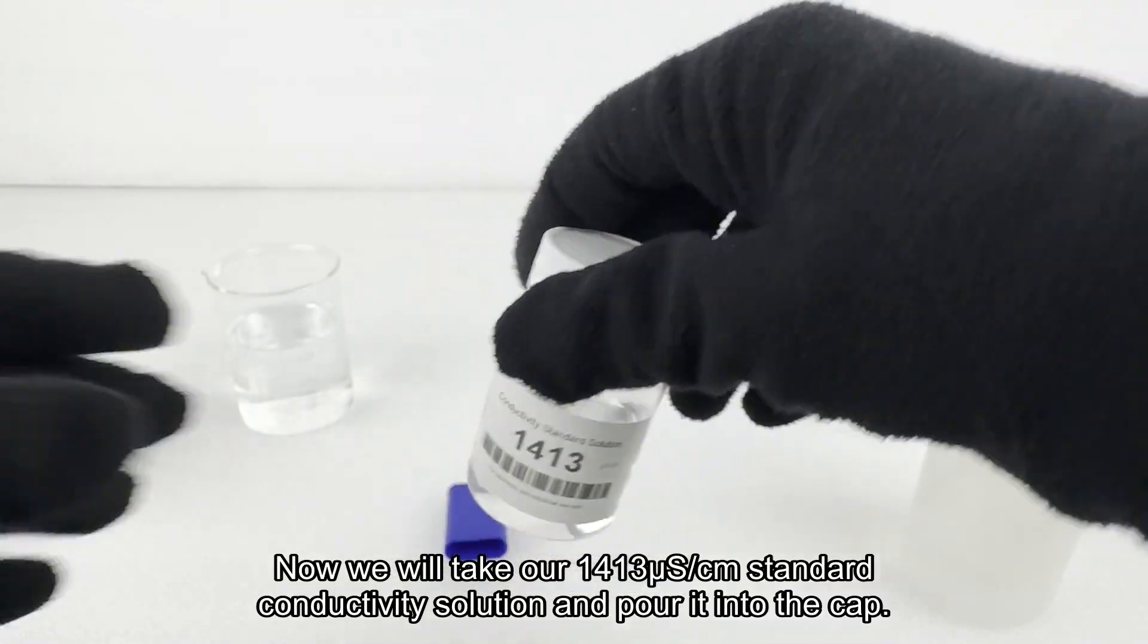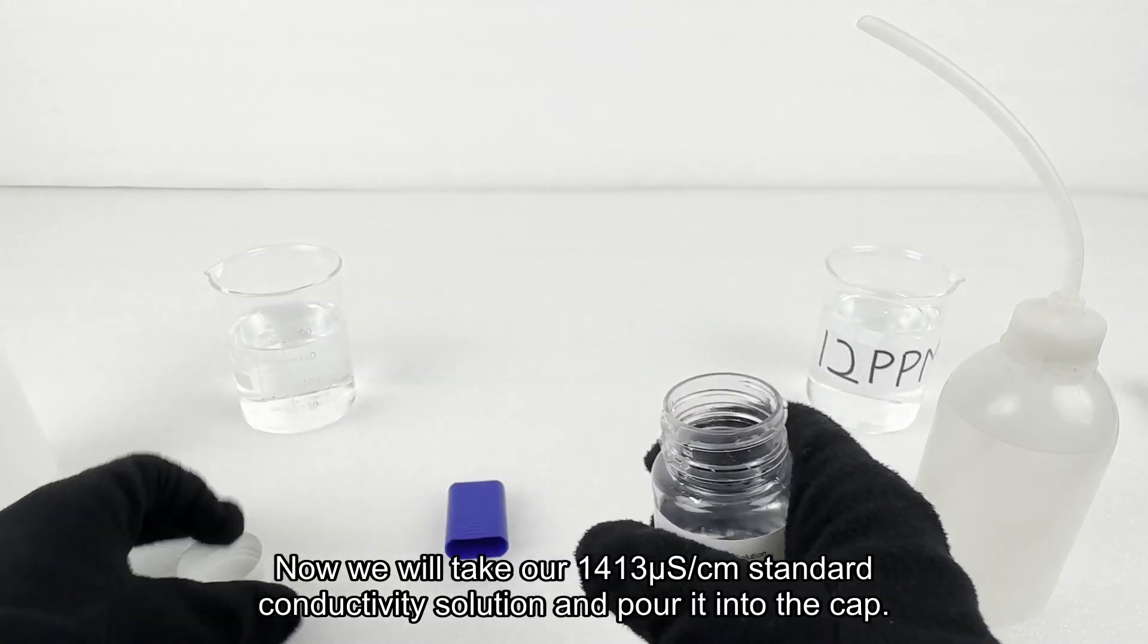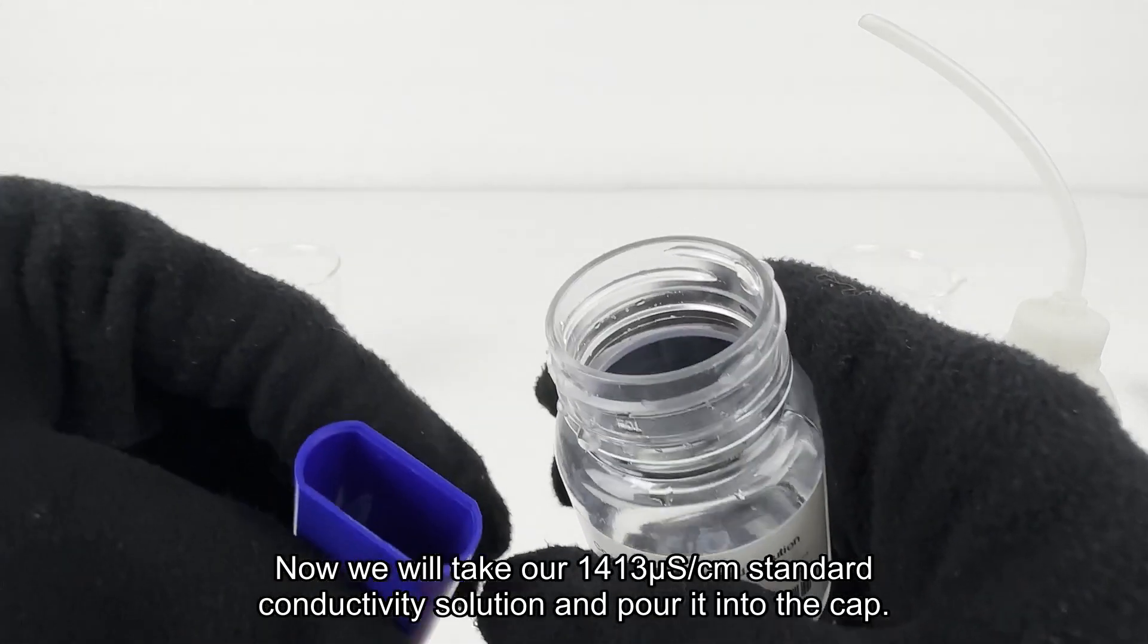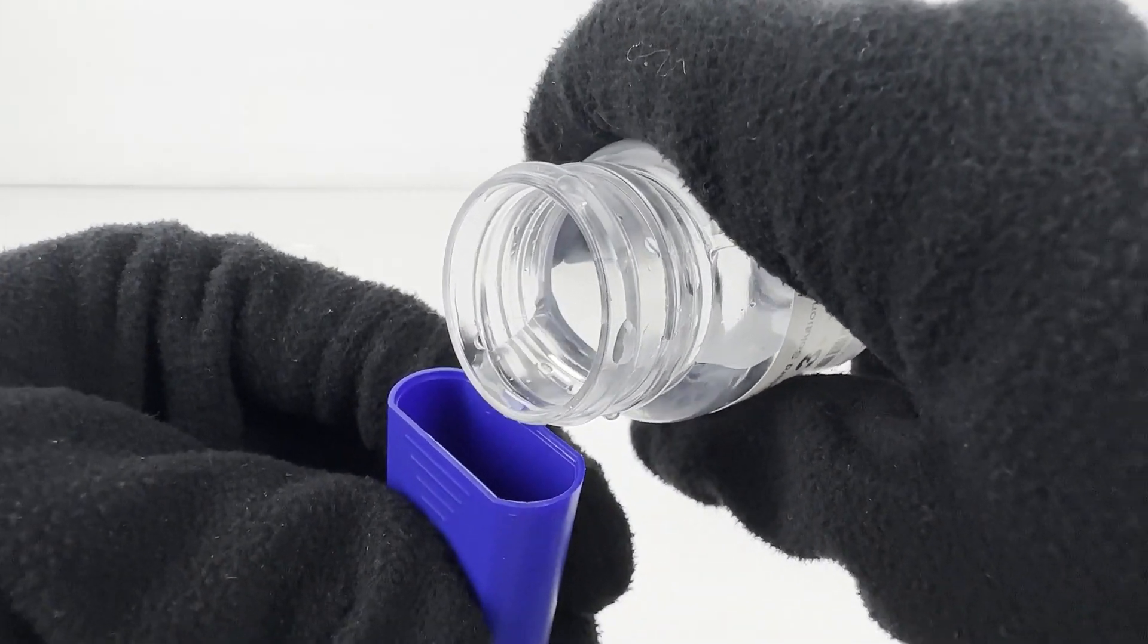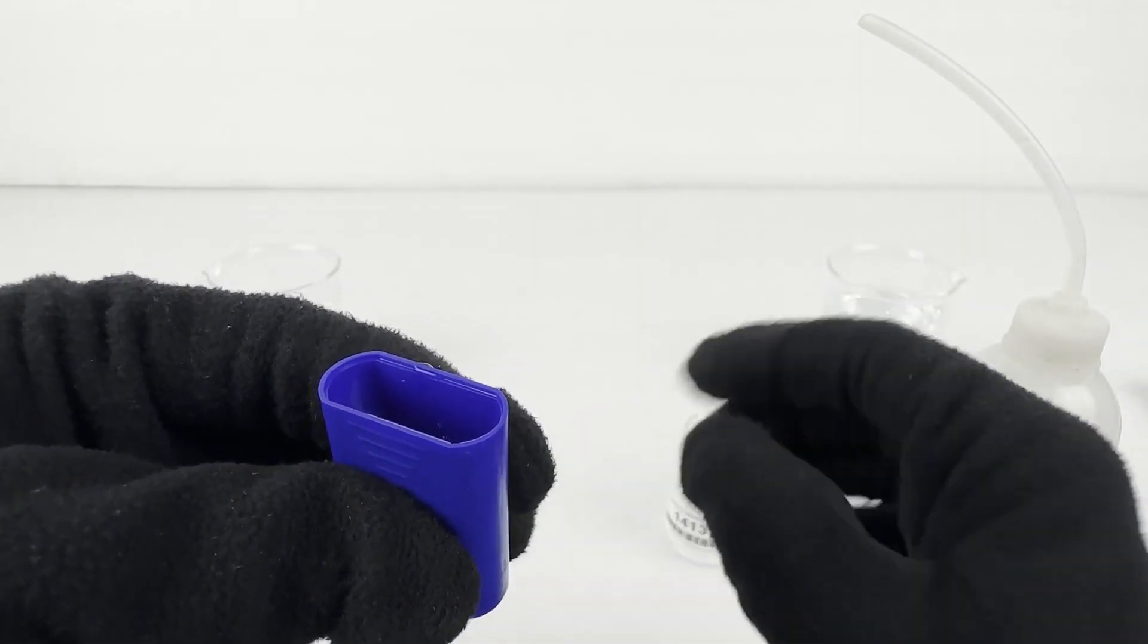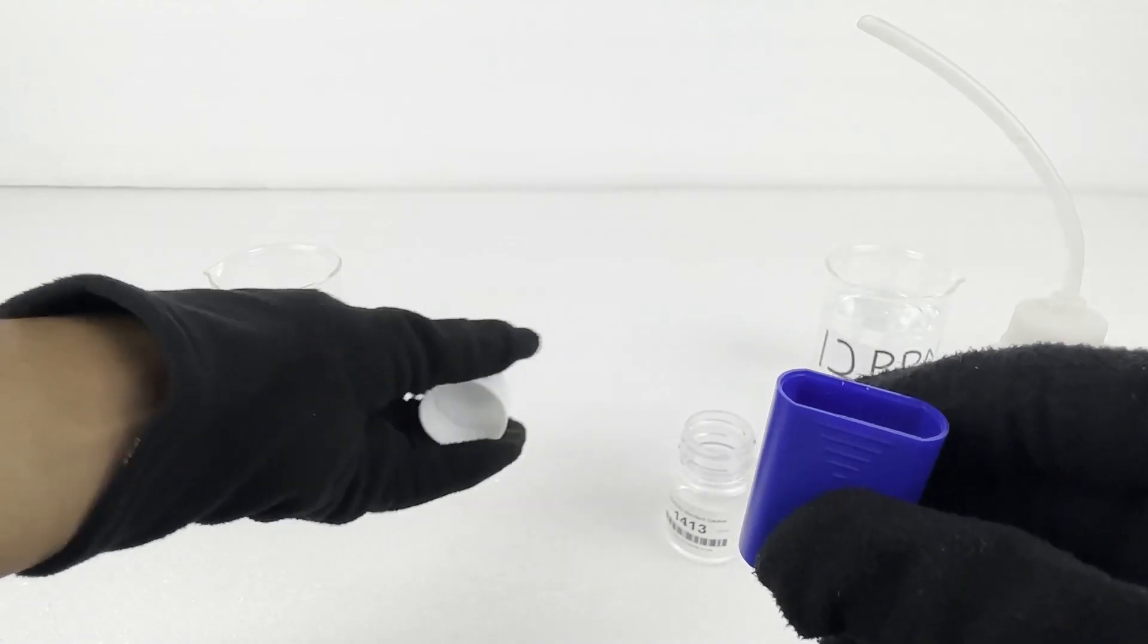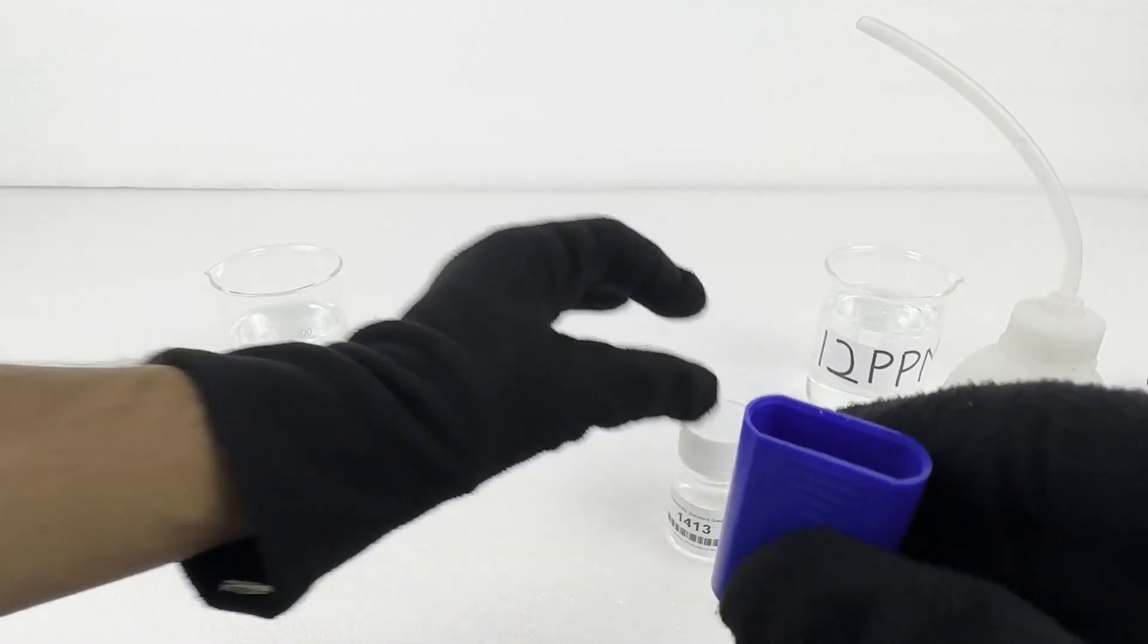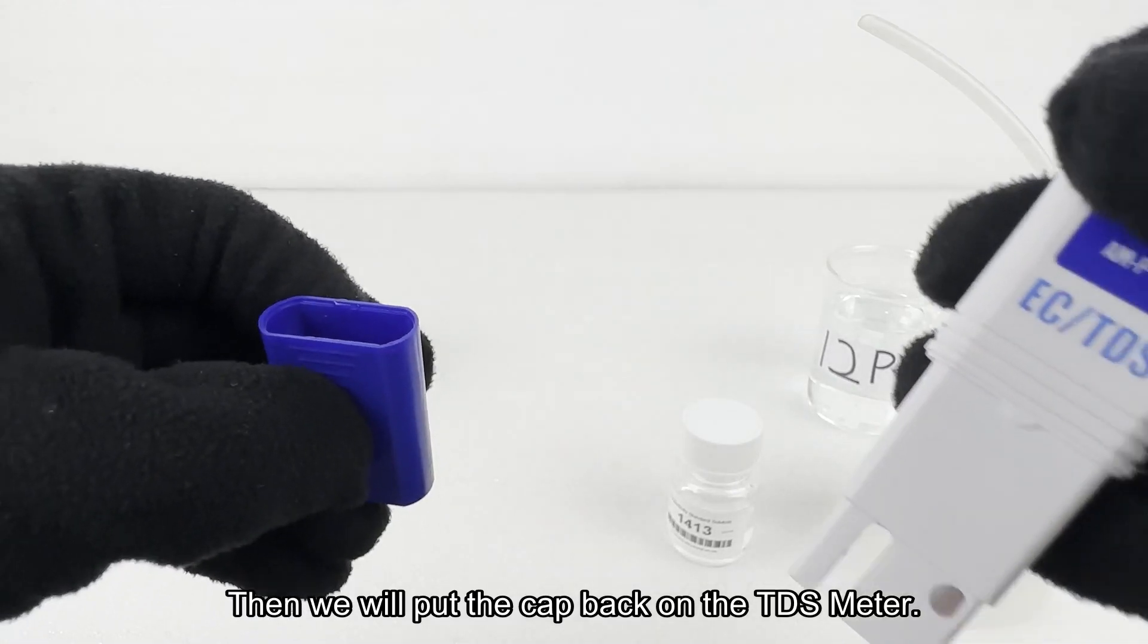Now we will take our 1413 micro Siemens standard conductivity solution and pour it into the cap. Then we will put the cap back on the TDS meter.